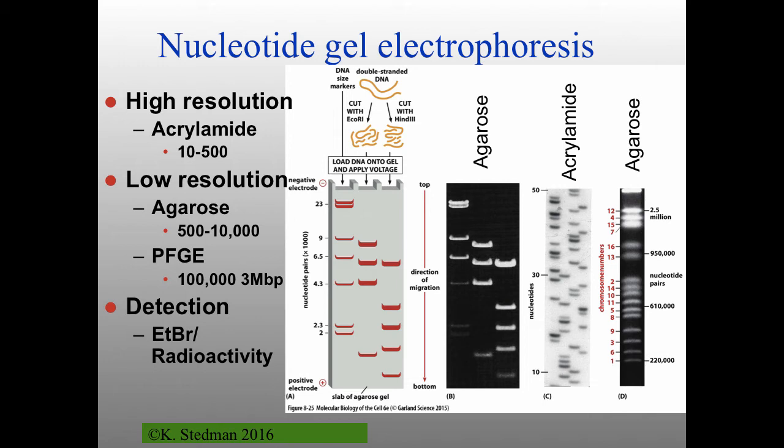So agarose gel electrophoresis is by far and away the most commonly used method. I'll be using it in the lab a ton next term in the mutant viruses from hell class. So that's what standard resolution is with agarose. Again, this is the polysaccharide from seaweed.